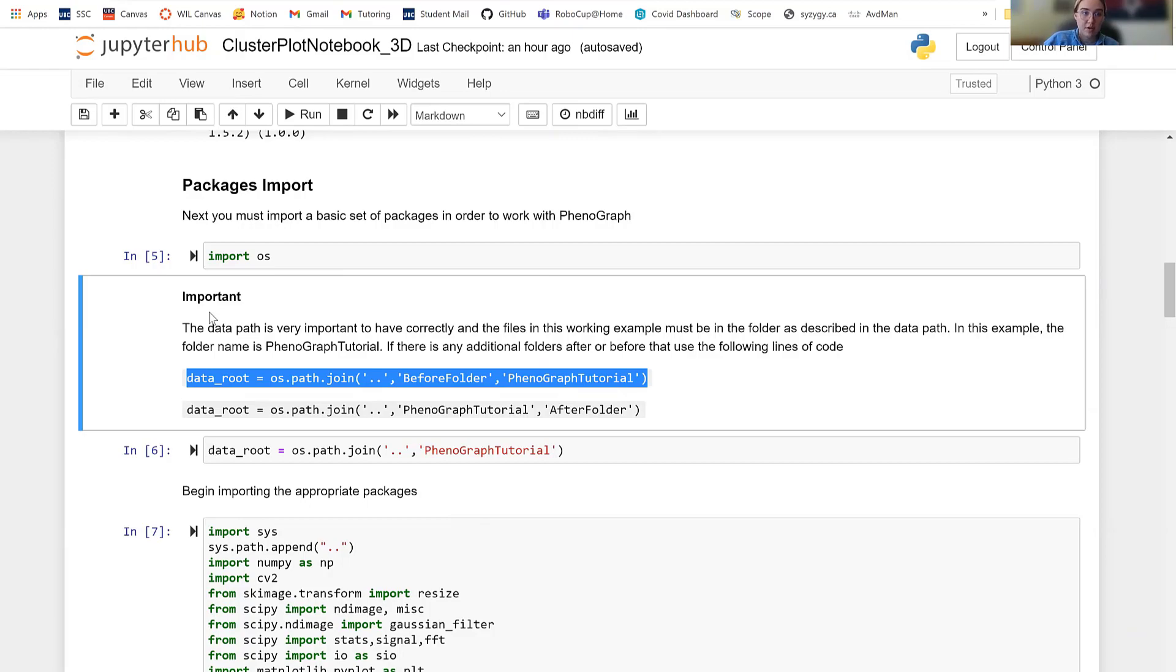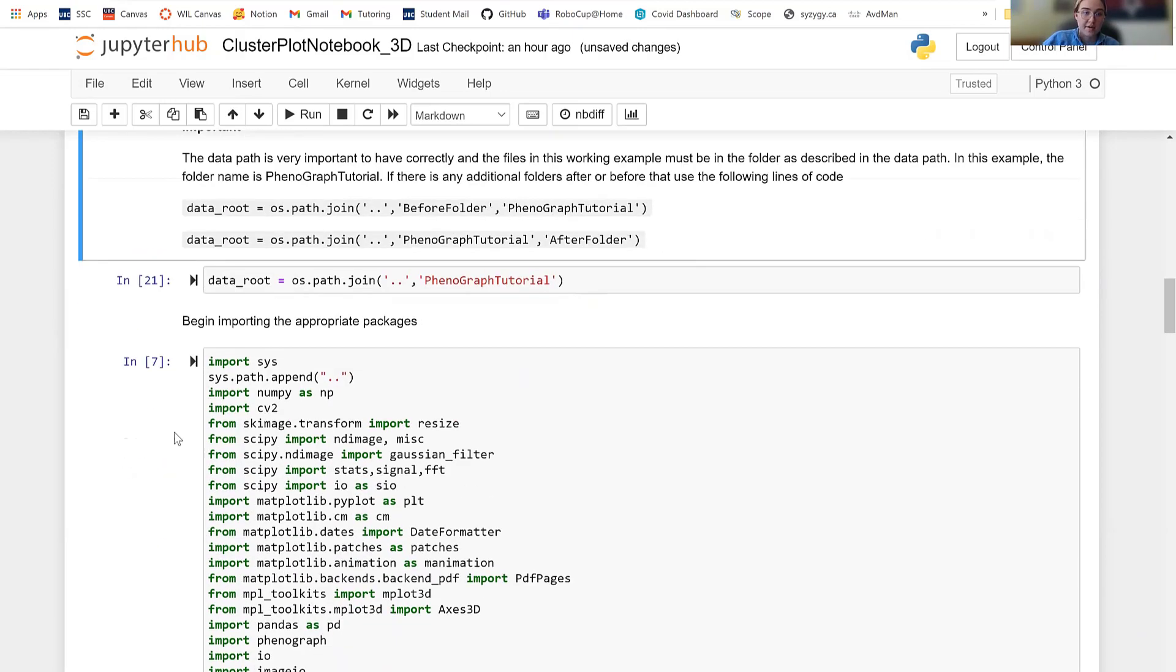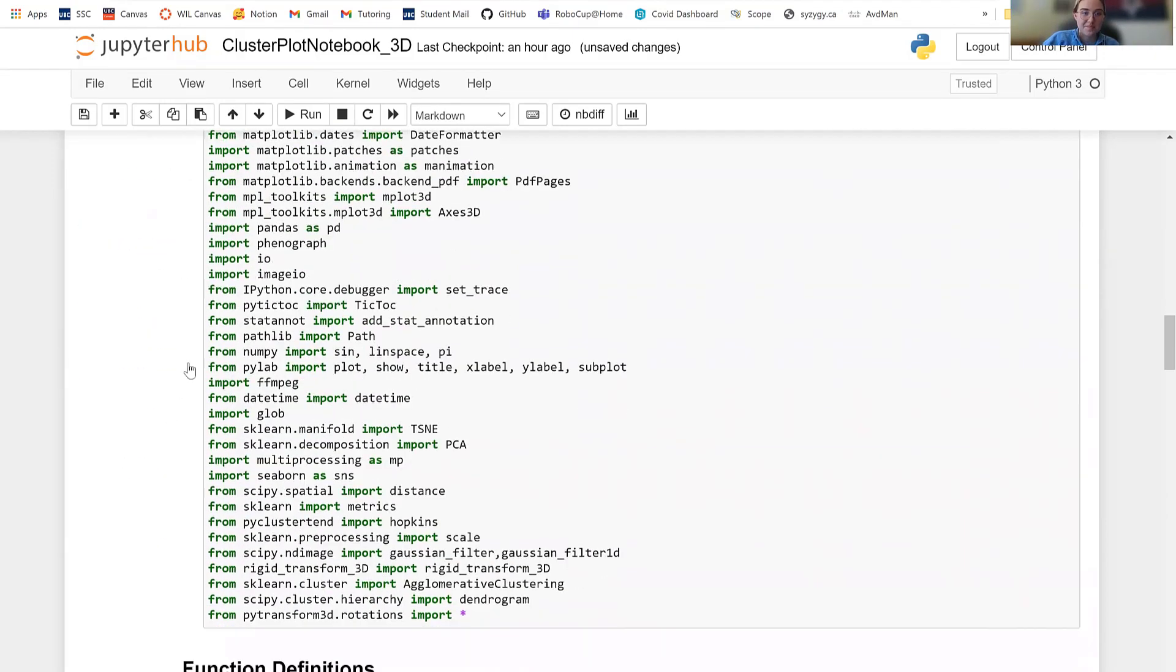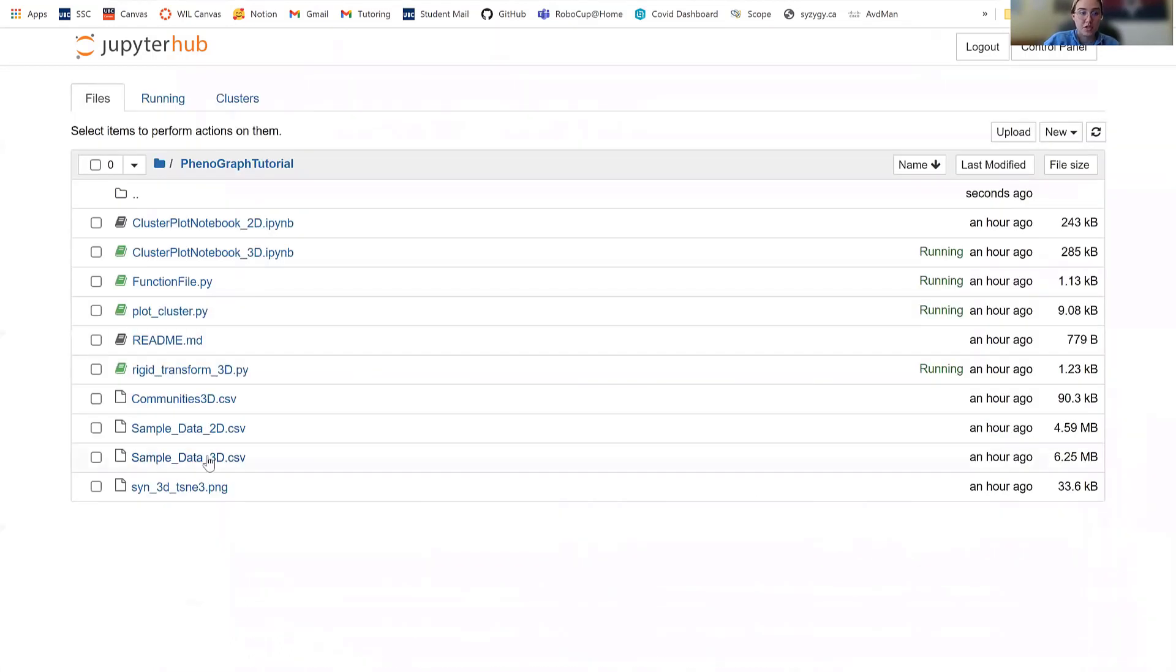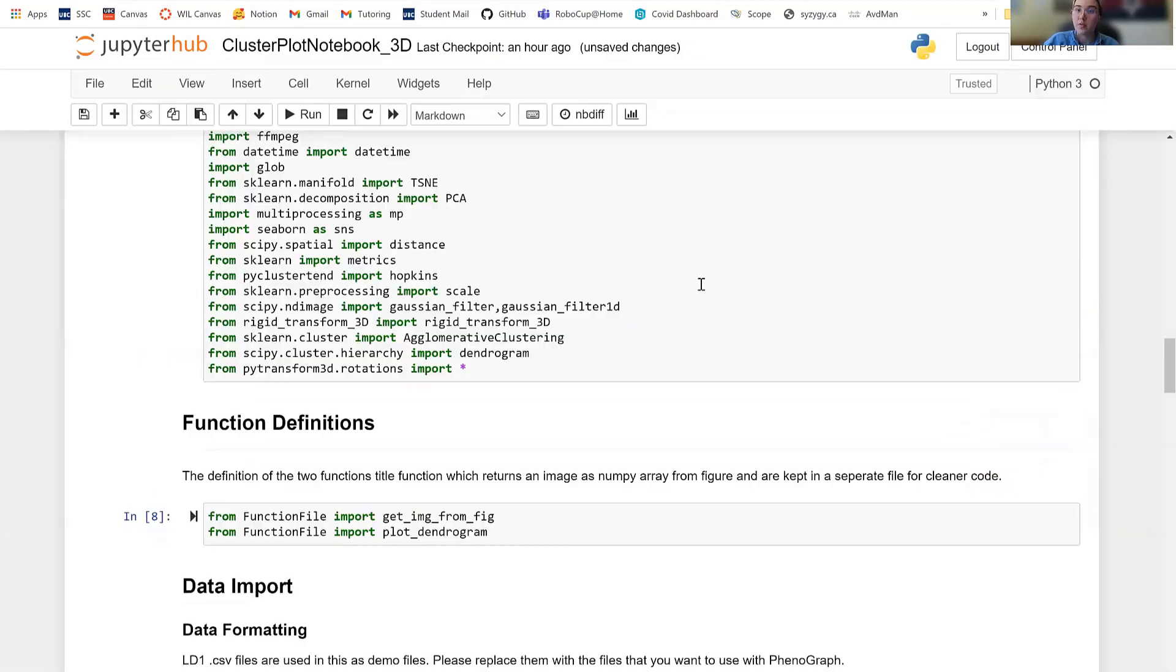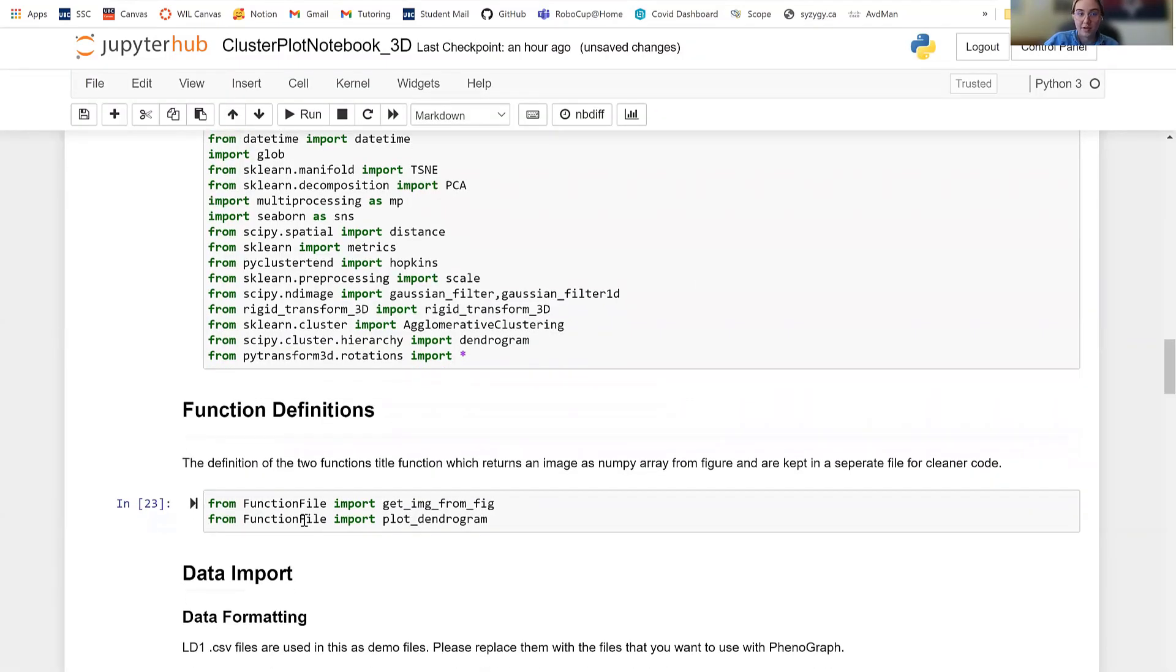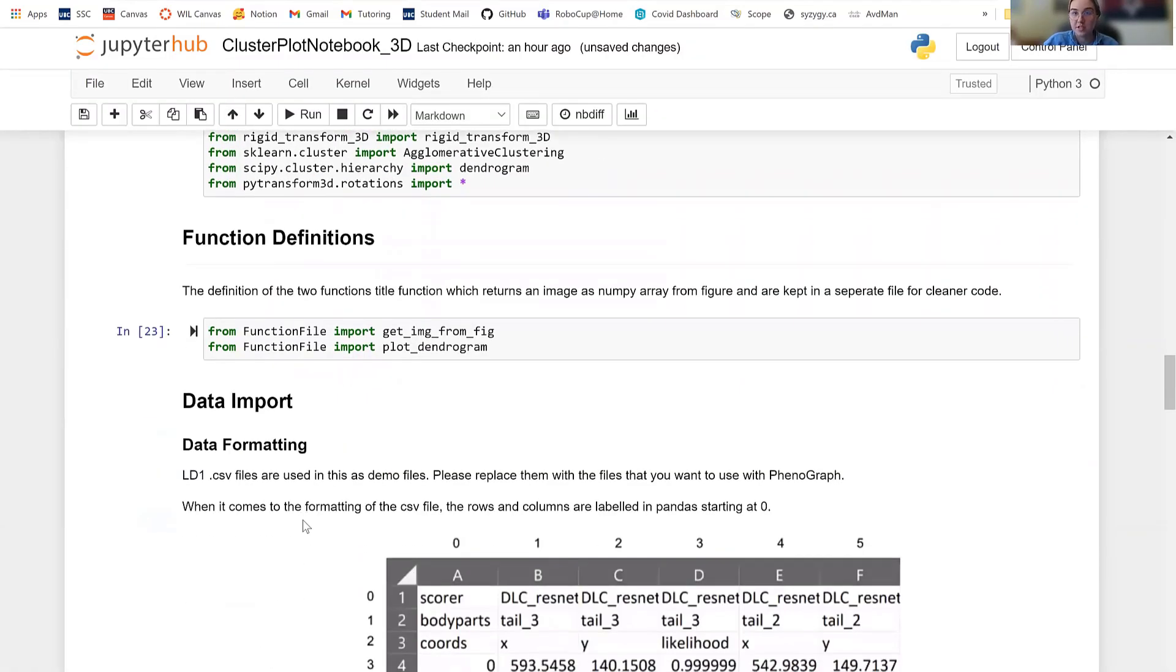So after you run all this, I'm just making sure it runs again, you're going to come here, and do you remember how we ran function file here? Well, now that it's up and running, you can import the methods from there. So that's good.